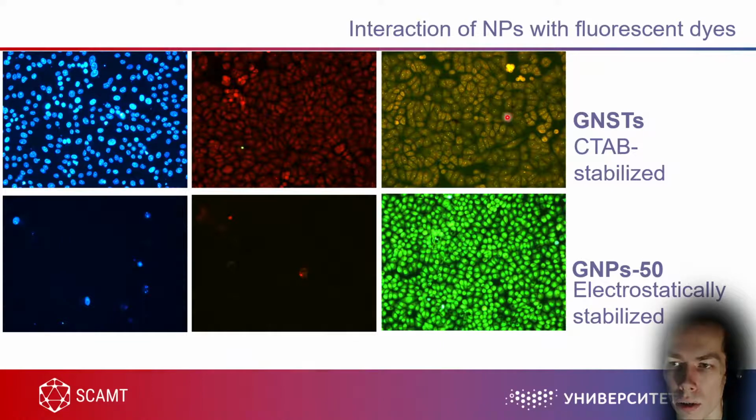But special attention should be paid to this picture, because we see here not just enhanced staining like in the case of these dyes, but a change in color. Why has the color changed from green to yellowish to even some kind of brown color? Well, as you probably remember, I told you that acridine orange can stain different types of organelles in different colors.